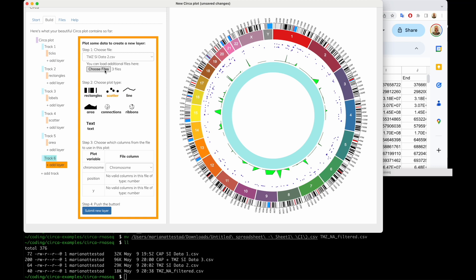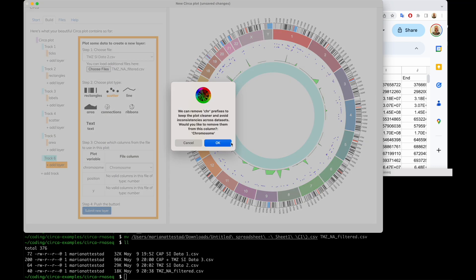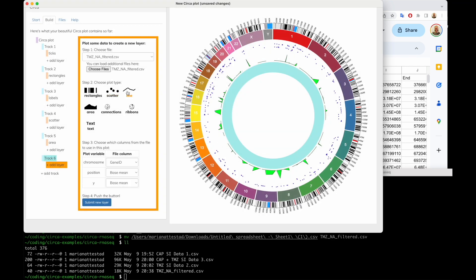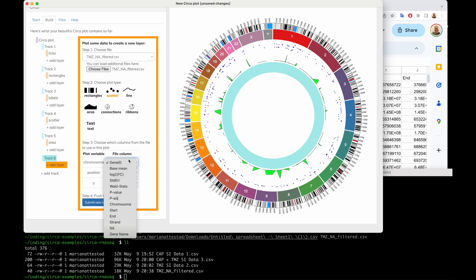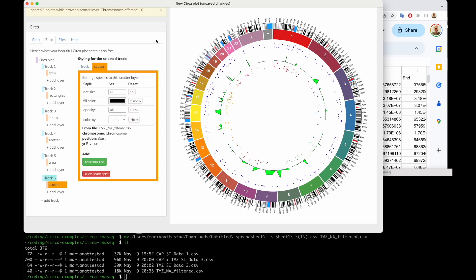So now instead of the usual TMZ file, we're going to load the new NA-filtered one. Let's see if that helps. We'll click around again — and now it looks like we can do it. We're going to do chromosome, start, and p-value, and boom — we've plotted those.